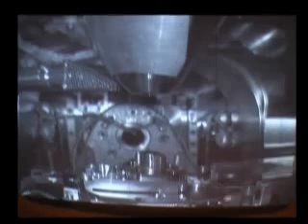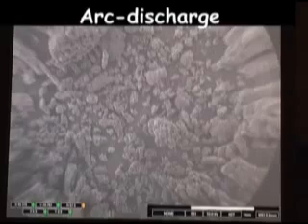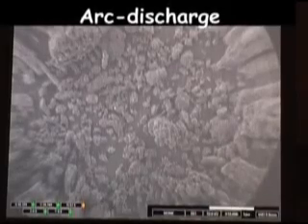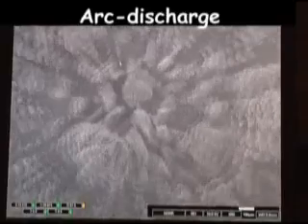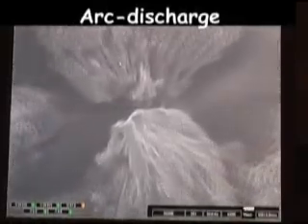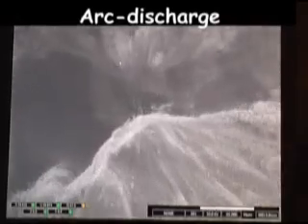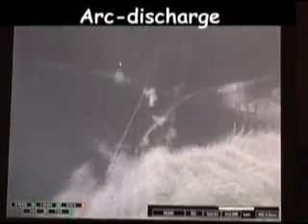Let's change the sample and look at the arc discharge tubes. At low magnification we can see already that with arc discharge we have produced other forms as well as nanotubes. But let's zoom in to find individual tubes. And there they are.